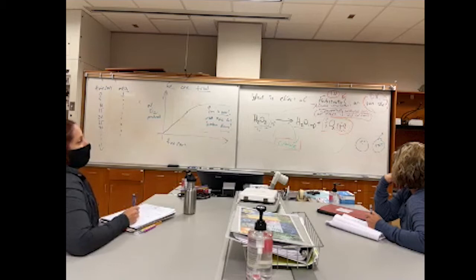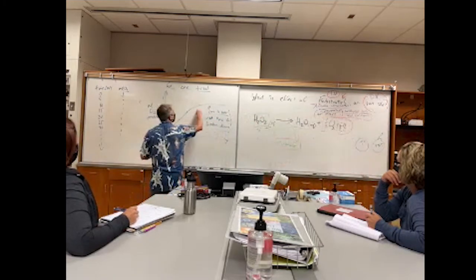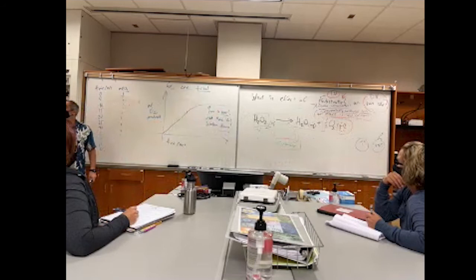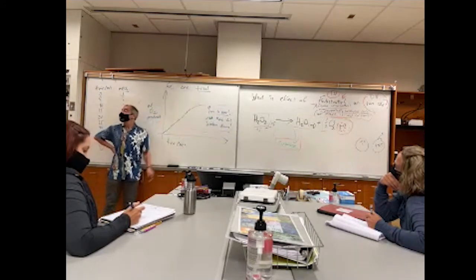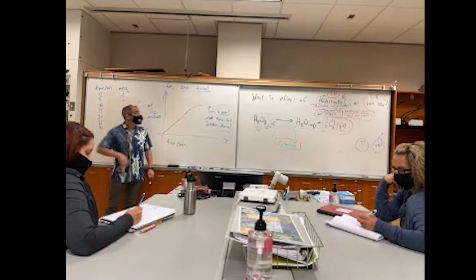It's the same thing. If you're looking at this graph that looks like it's rising up and flattens out, it's going to look similar to another graph later on that actually is describing enzyme saturation, but this one has nothing to do directly with showing any kind of saturation. This is just showing the reaction is done. The reaction is over, because all the substrate is broken down.